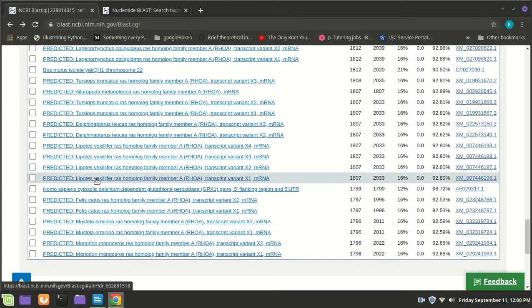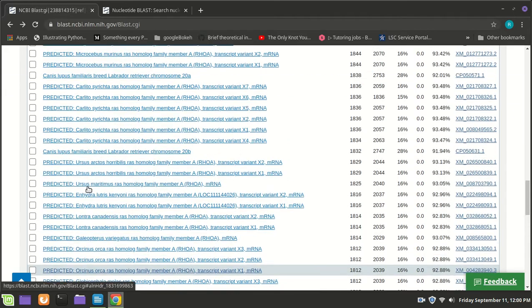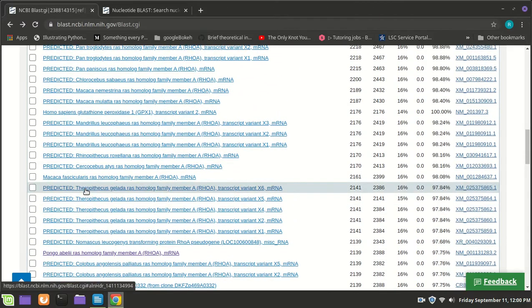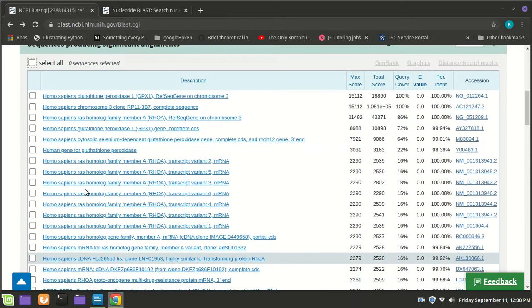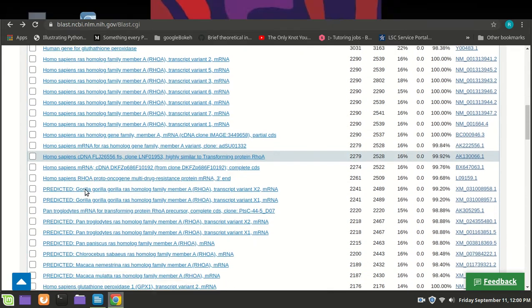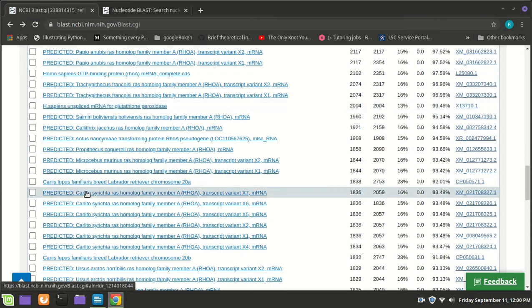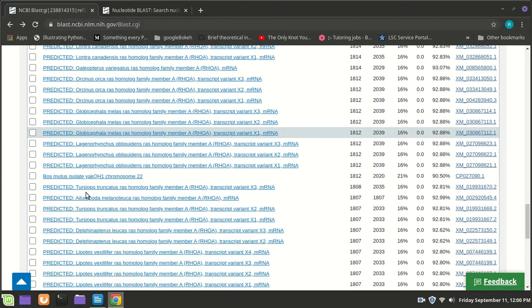Oh, we don't have many down here. Well, RHOA, the first one. Yeah, GPX is only up there at the top, but I would have liked to have shown you how that would have been. It would have been the same thing except for later in that sequence, because that's where the GPX is. It's in the second half.